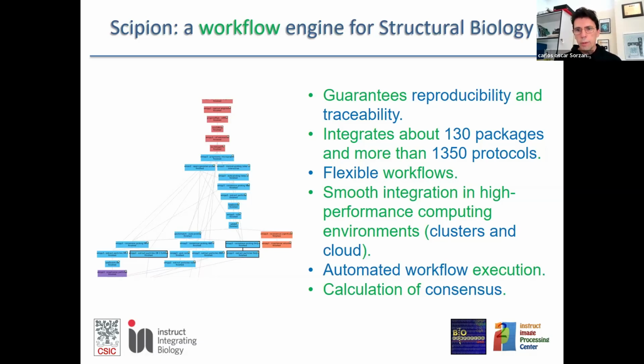It integrates well with clusters, high-performance computing, and cloud computing. It allows the definition of the workflow manually, so you can add the steps one by one, or if you have a predefined workflow, you can execute this workflow fully automatically.